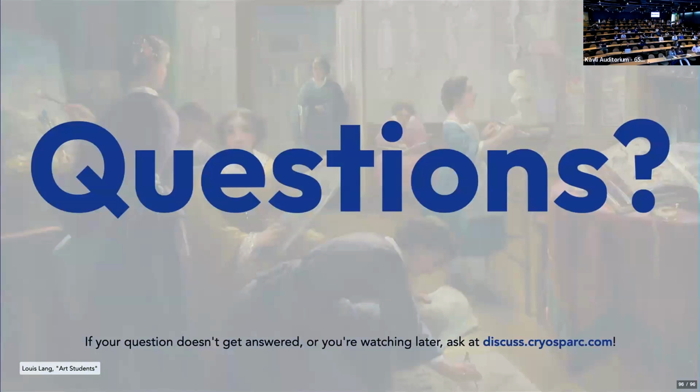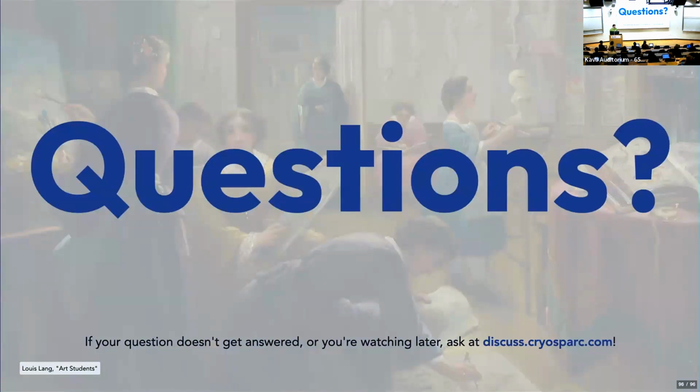That's a good question. So the question was basically, if you do a range of defocus, why not just use one focus? I think there's two sides to that. One, I think you don't really have another choice. The reason is those zeros. If you always collected at the same defocus, you would have absolutely no information about certain frequencies where the contrast transfer function is zero. So even though ideally you'd be able to just collect at focus or pick one defocus and stay there, I think in practice, you unfortunately can't really do that.